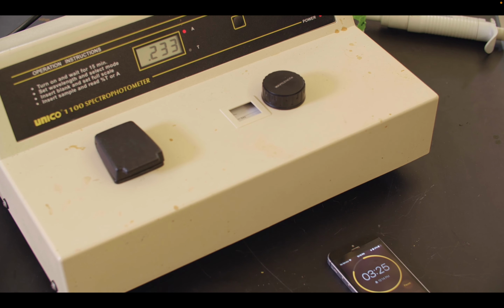So it was 0.234 at 30 seconds. All right, at a minute, it is 0.225. At a minute and a half, it is 0.216. At 2 minutes, it's 0.205. At 2.5 minutes, it is 0.194. At 3 minutes, it's 0.181. And at 3.5 minutes, it is 0.167. And at 4 minutes, it's 0.163.